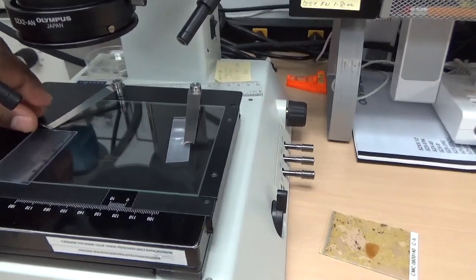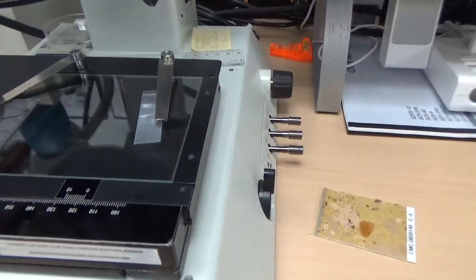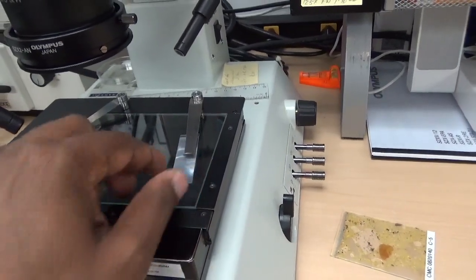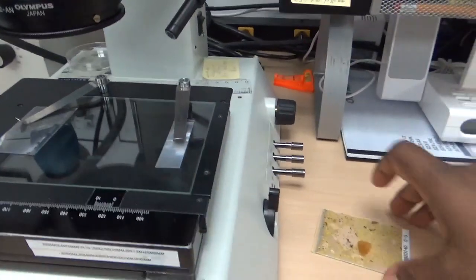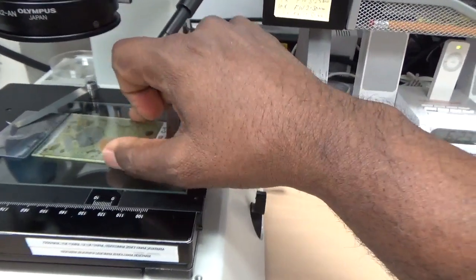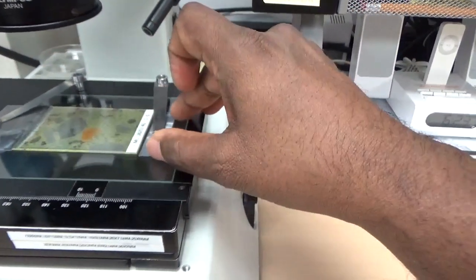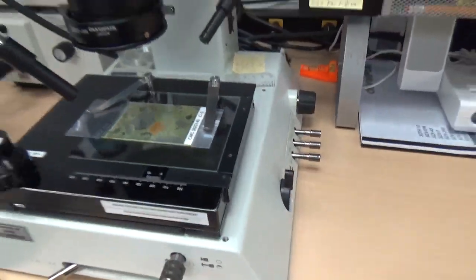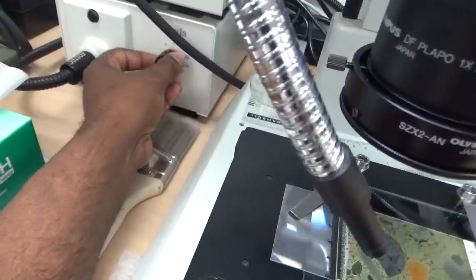So we don't attach the clip to the thin section, but we put two on both sides and put the sample in the middle so the sample doesn't move during scanning. Like that. And turn on the light.